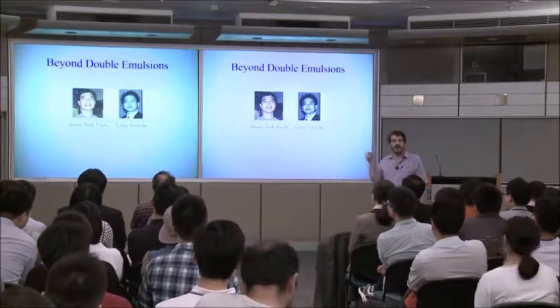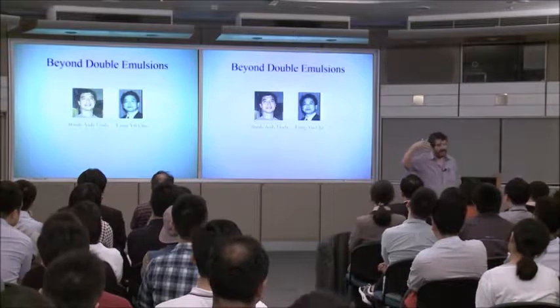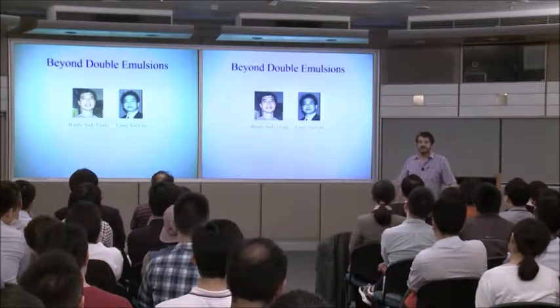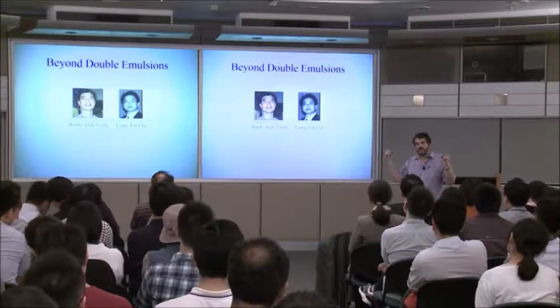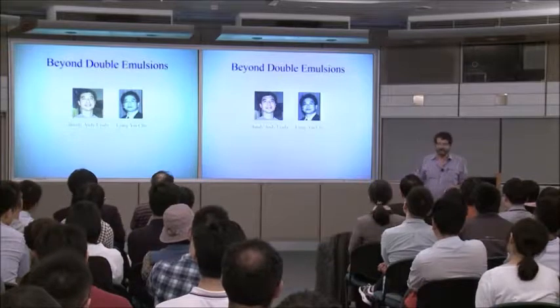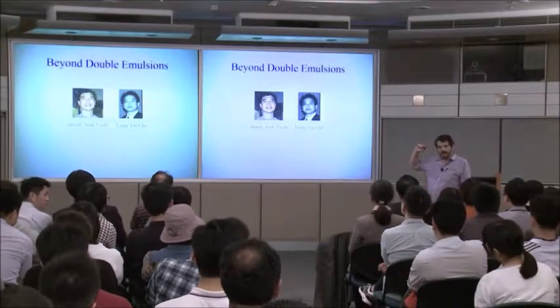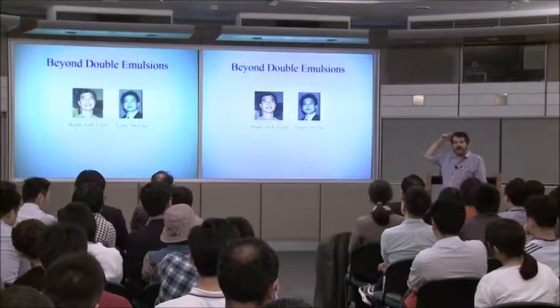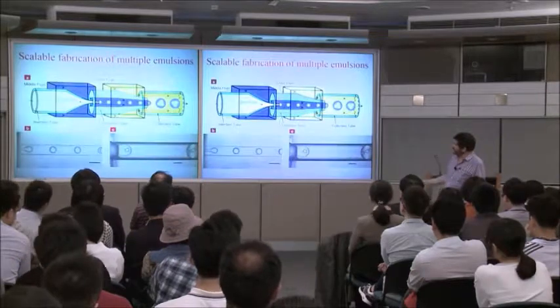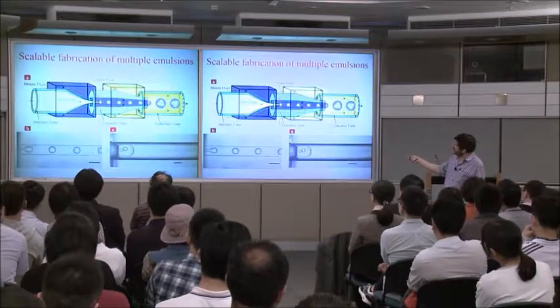But Liang Yin visited us from Sichuan University, and he liked the way Andy did things. Andy quickly taught him how to make these things. But Liang Yin said, well, look, I can really control things. I can align things really well. So let me make a slightly different structure. So rather than making this structure that did the co-flow, or the flow focusing of a co-flow, he made something that has two co-flow structures, but it collects here and runs them into here.